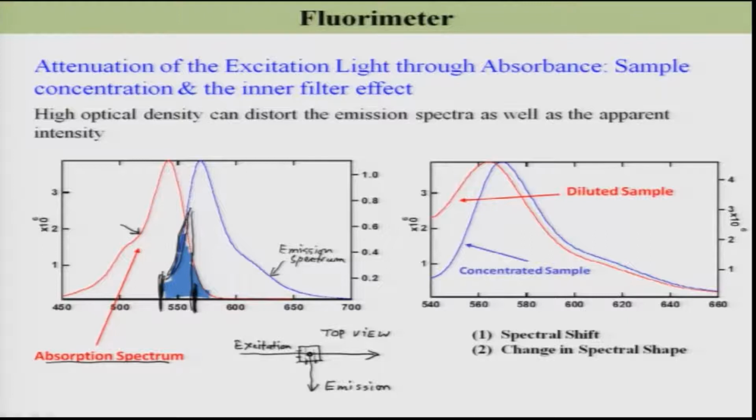So, I need to ensure that the emission intensity in this region is a real one and not somewhat absorbed by the unexcited molecules.